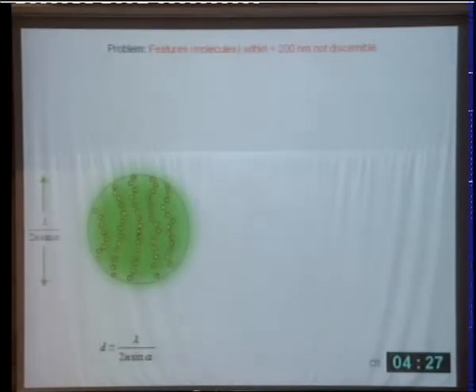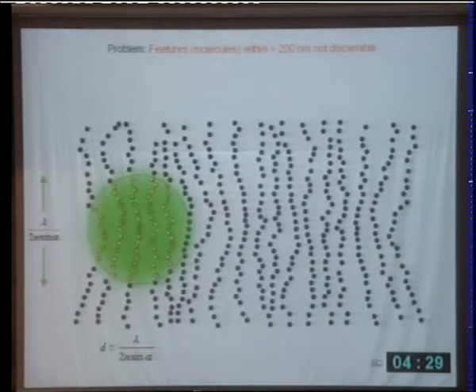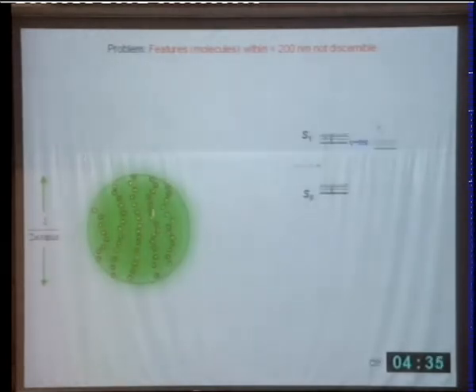So we just concentrate on that, and so I can explain everything within this, say, typical range, because once I have a solution, I can apply it to the rest of the object, and we're done. So it's safe to concentrate just on that region and to ask, why can't we separate the features residing within this 200 nanometer zone?